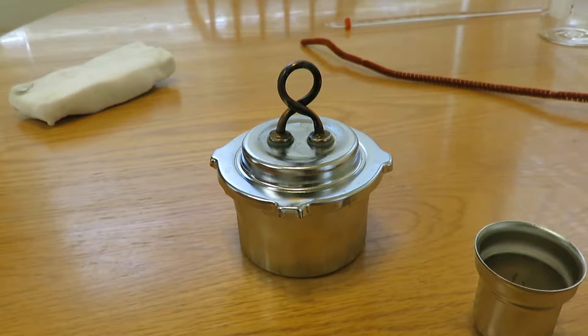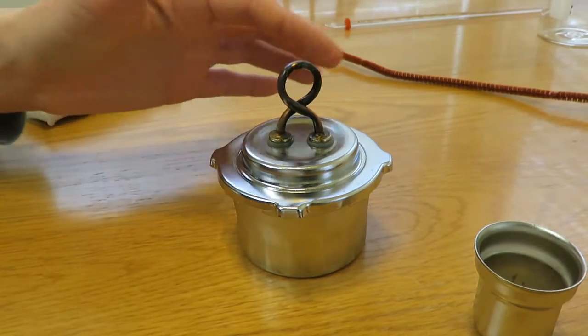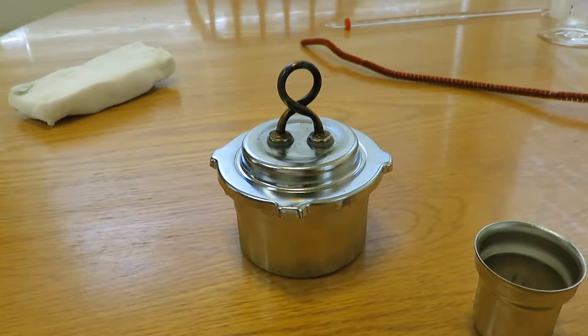We need our alcohol burner for various chemistry experiments we've been doing, but the last time we went to use it, it wasn't burning very well. There's some sort of buildup on what they call the burner torch, the wick area of the burner.